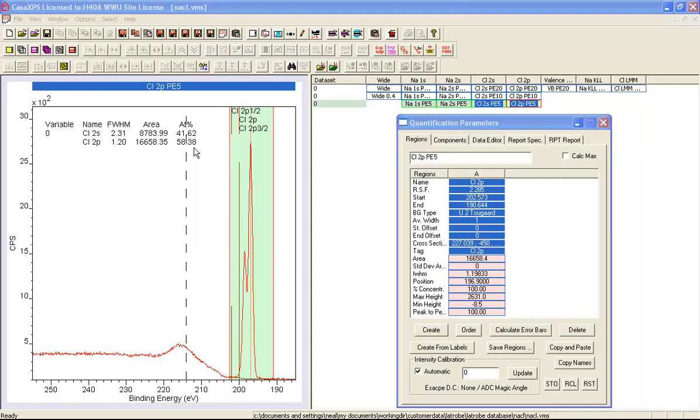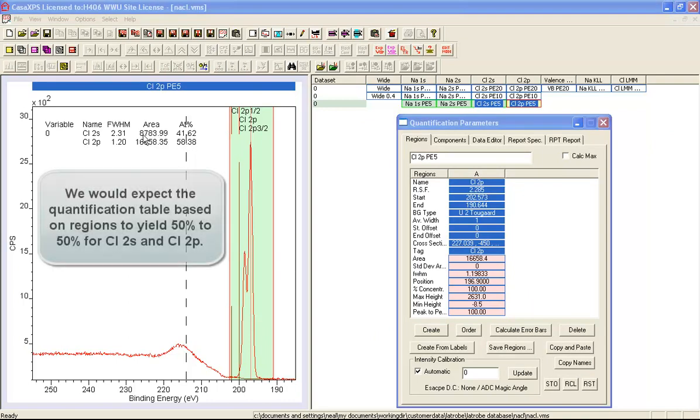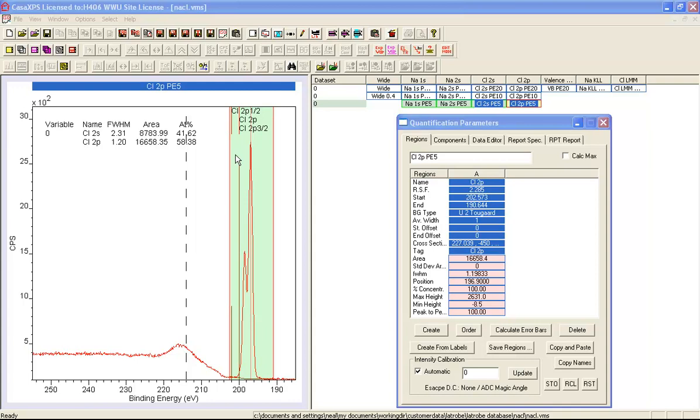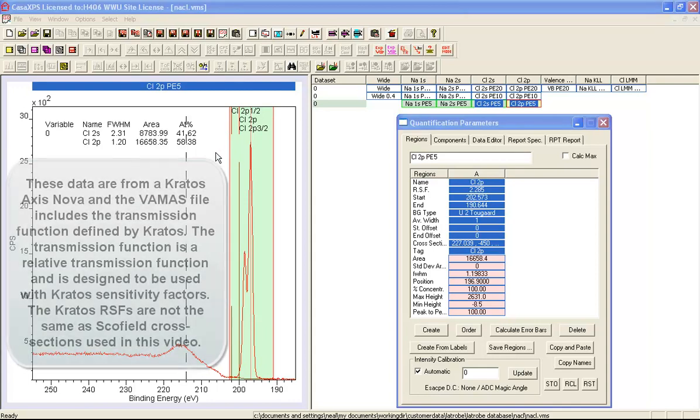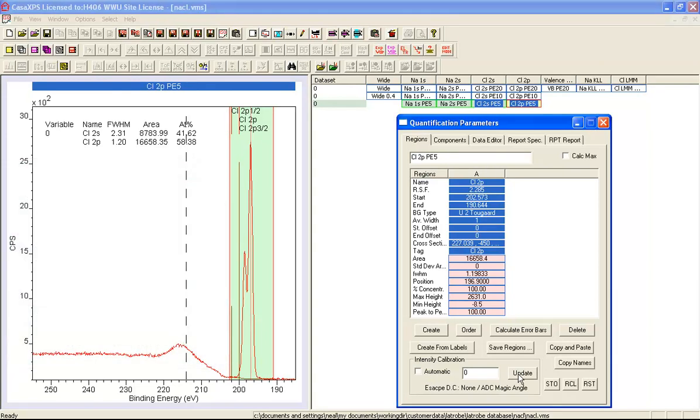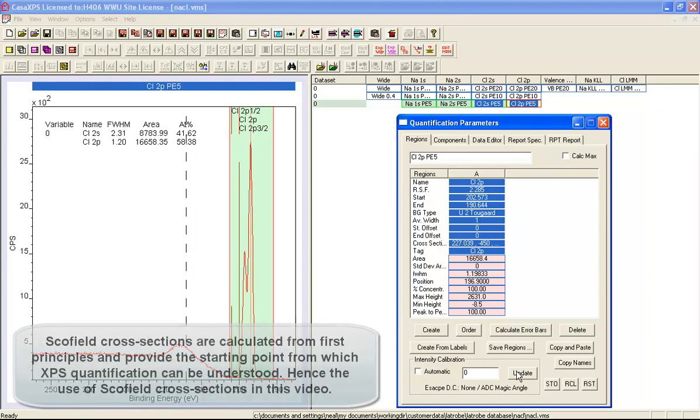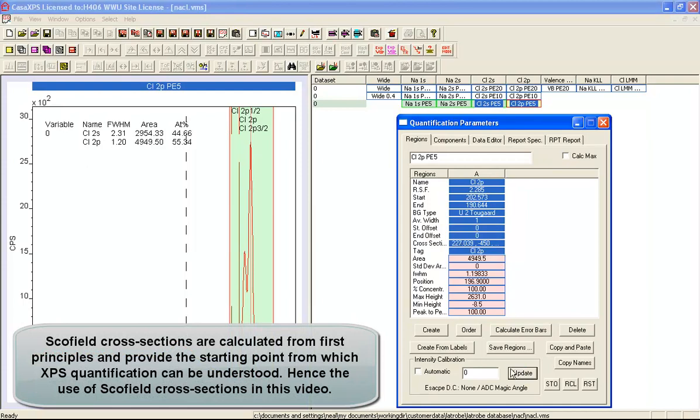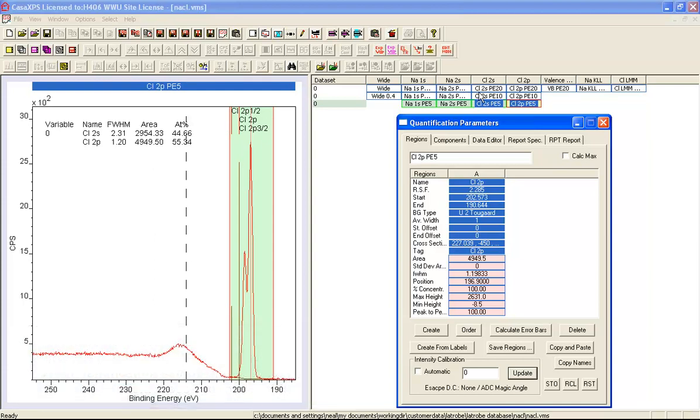The quantification as it stands doesn't look particularly good because we really ought to be getting 50-50 here but we've got close to 60 to 40. One of the reasons why it's so far out is because I'm using currently the transmission function that has come in with the data. This is a relative transmission function that is designed for Kratos data and Kratos sensitivity factors. I'm not using Kratos sensitivity factors, I'm using the Schofield cross sections. So I've unticked this button and I'm going to say update so that will apply to this entire file. You can see that the difference has become closer to what we'd expect. It's now 55 to 45.